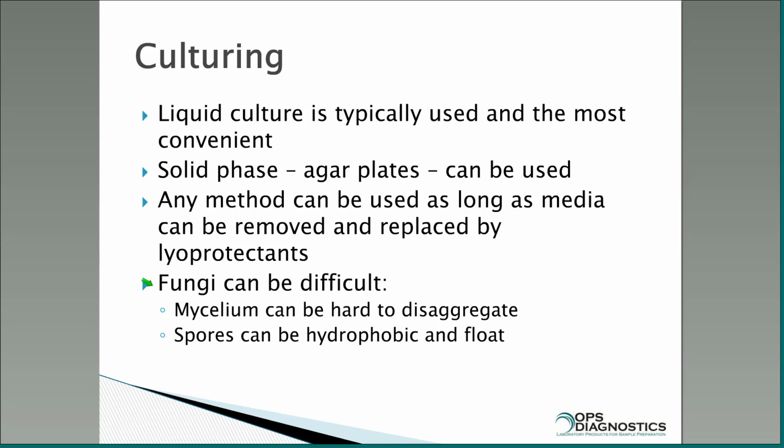On the one hand, mycelium, you can end up with a big fungal mass that just doesn't want to dissociate or disaggregate, as I put it here. So what do you do? You have 10 mils of microbial freeze drying buffer and a big blob of fungus in the middle of it, and you're trying to break it up. There's not a good answer for this. If you can break it up without destroying the viability of the cells, then try to do just that, pipette it up and down or whatever the case may be. Or you can just freeze dry the big blob.